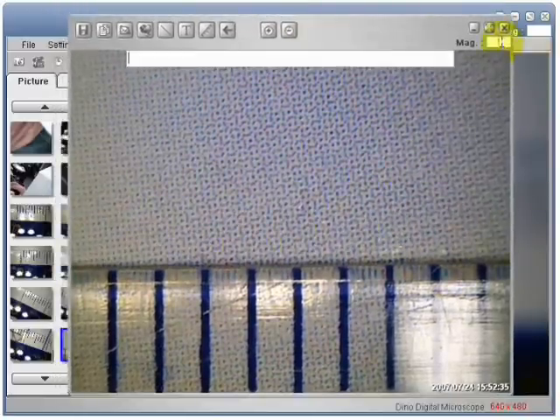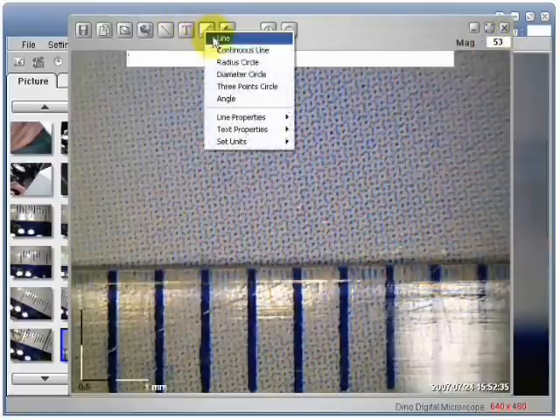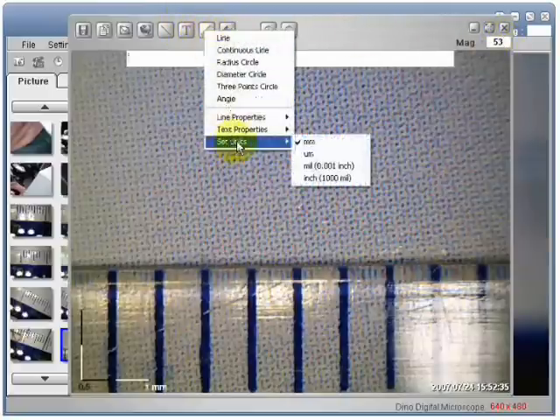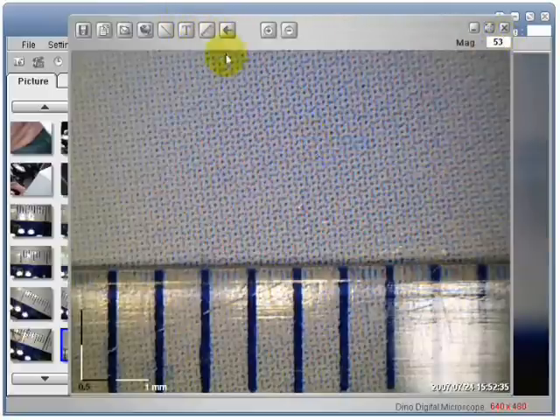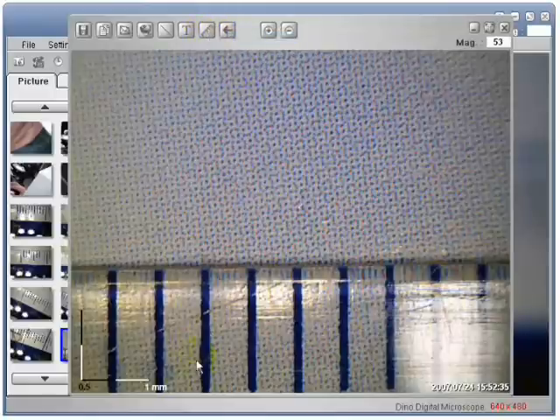Set the magnification. Select desired units of measure. Then select what measurement function you want.